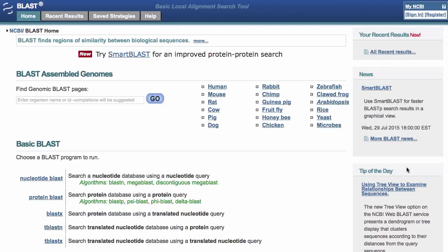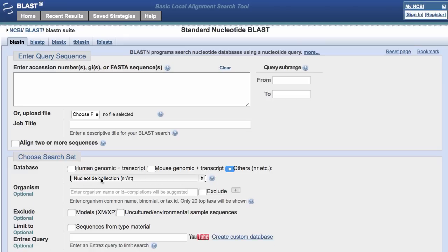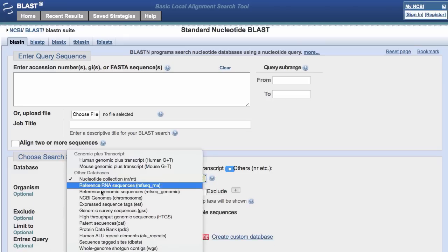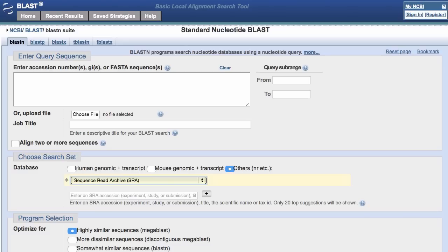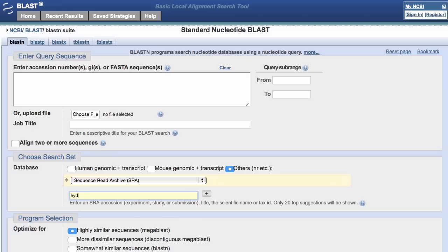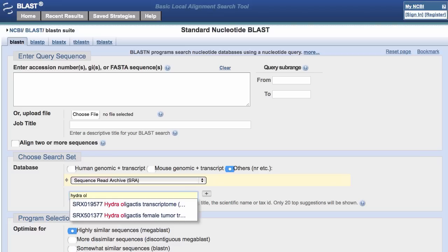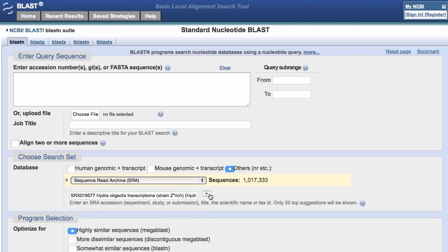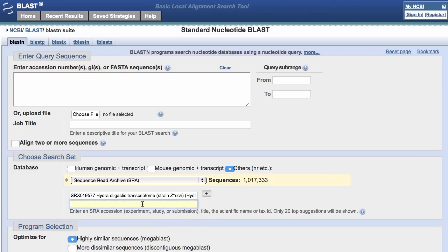There are a number of ways to get to the data, but I'm going to start with the BLAST page. I'll go to the main BLAST page and select Nucleotide BLAST, then change the database menu at the very bottom to 'Sequence Read Archive.' I see a box to search by SRA accession or organism, so I'll start typing Hydra oligactis. I see two choices and I'll take the first one, then hit the plus sign and select the second one as well.